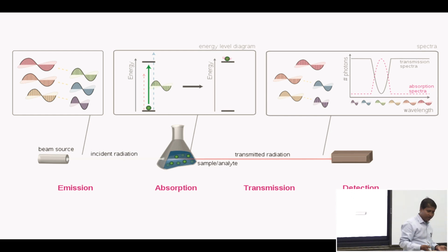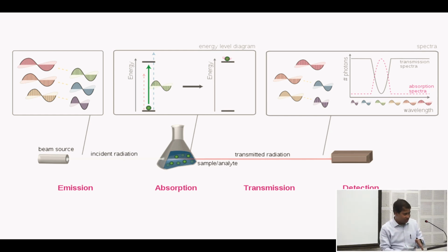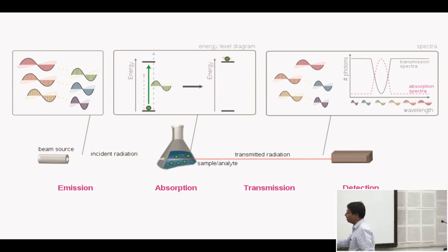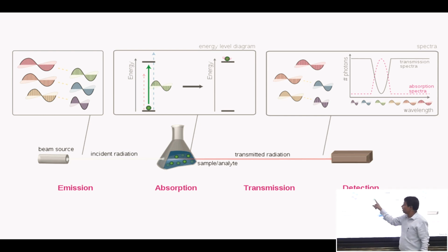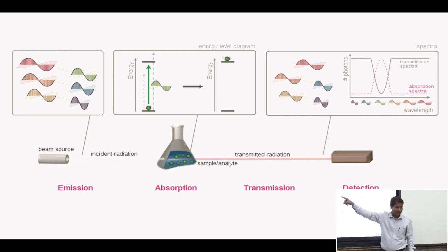Why should it absorb? There are certain conditions. The simple condition we can tell is that the energy levels match well. So it absorbs the green light and goes to the excited state. If it absorbs the green light, what will happen? You have everything except the green radiation.